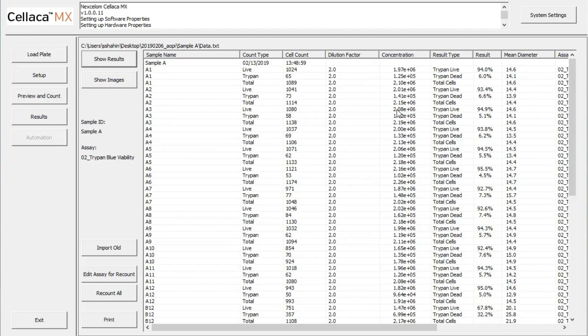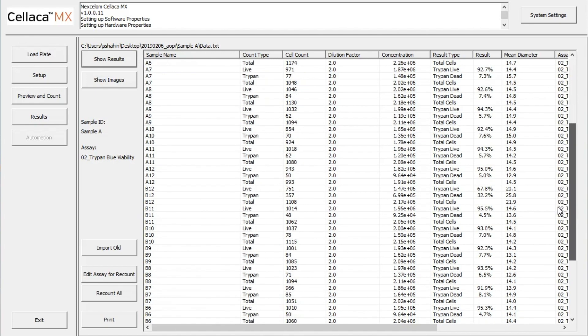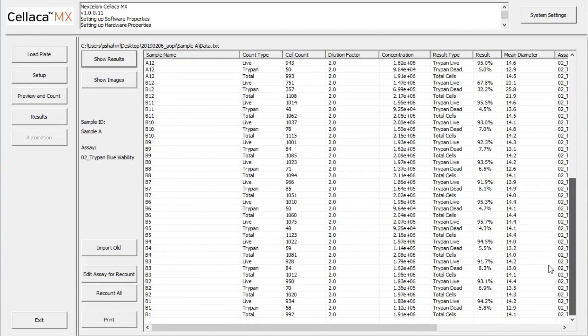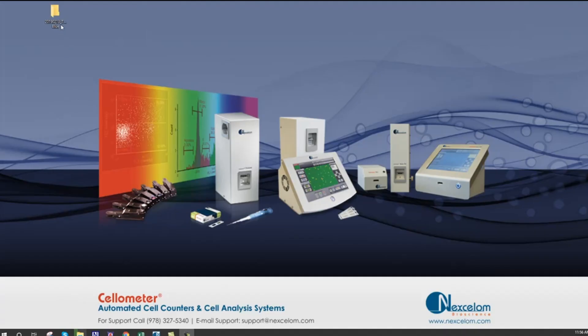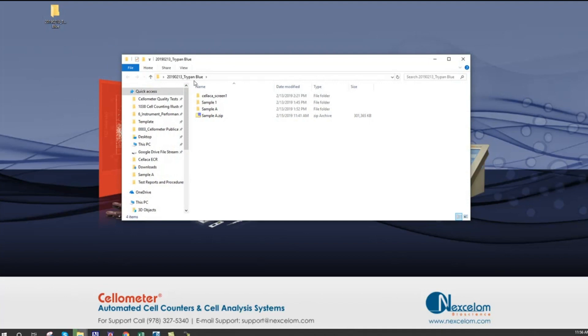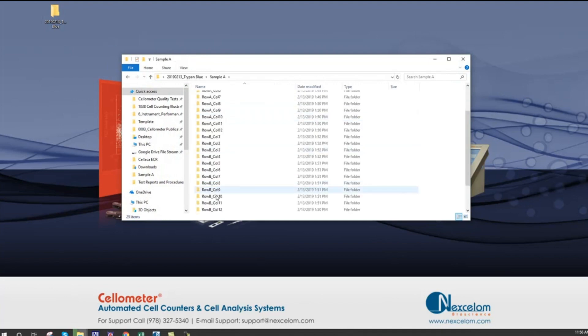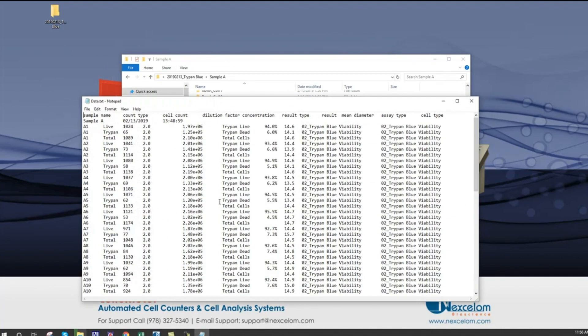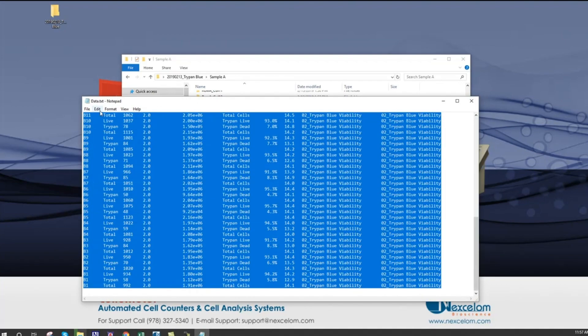It is easy to retrieve the automatically saved exported results by navigating to the saved folder in Windows File Viewer. All the data is saved in a text file that can be copied into Excel while maintaining all of the labels and columns.